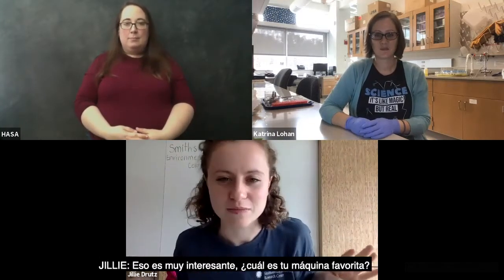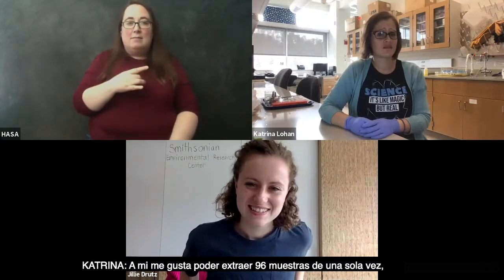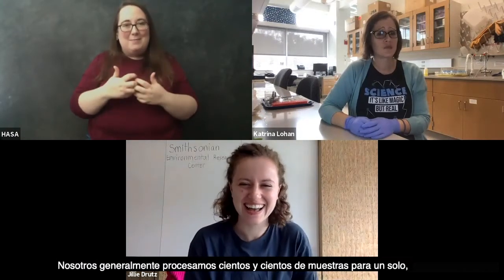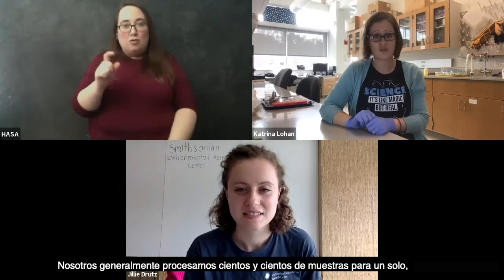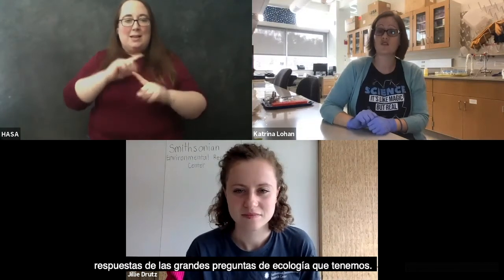Do you have a favorite one of those machines? I really like quickly extracting from 96 samples at a time. So I've got to say the big machine is probably my favorite. We generally process hundreds and hundreds of samples for a single project because it takes a lot of samples to be able to answer some of the big questions in ecology that we have.